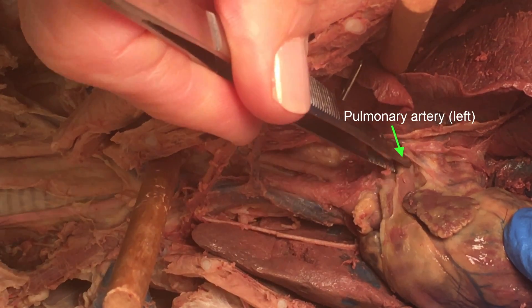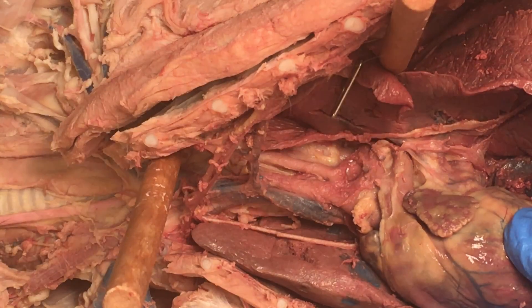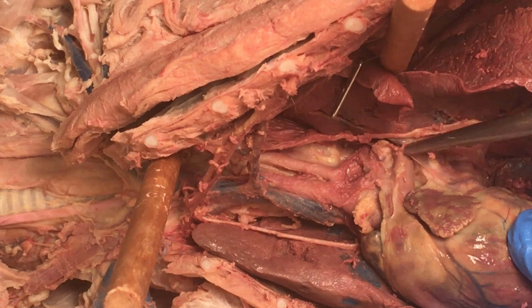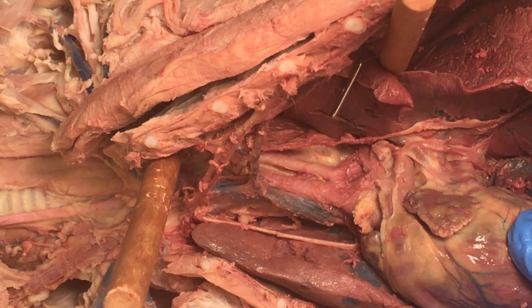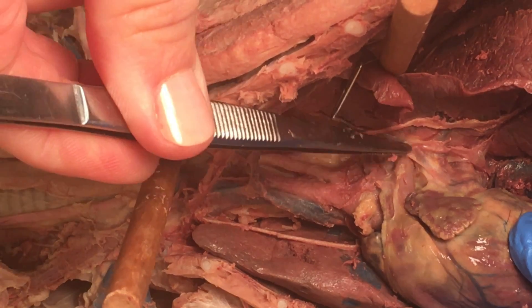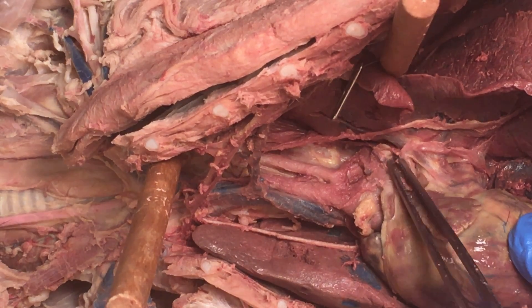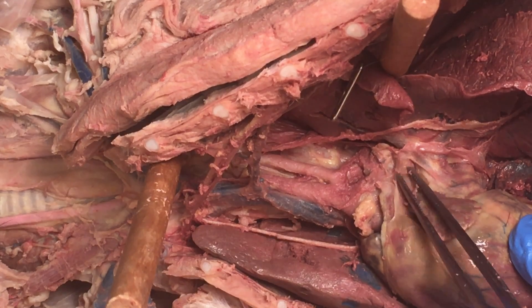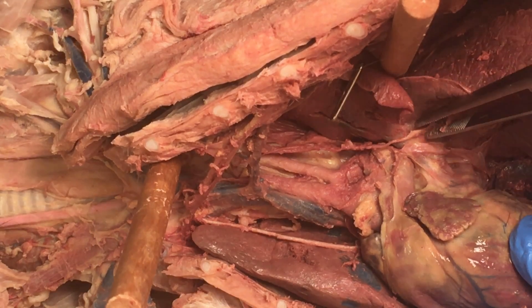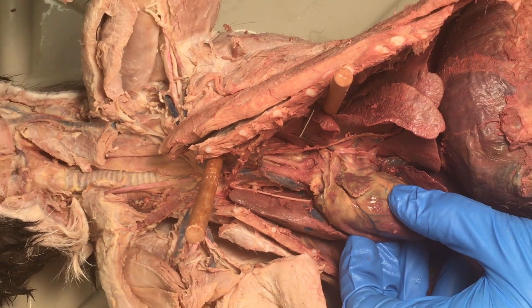The pulmonary trunk narrows into a pulmonary artery. You can't see the split to the pulmonary arteries right and left. One branch is under the heart and the other comes here to the left lung, so you don't see a satisfying Y-shaped split — you just see it kind of narrow and then head into the lung. This is a nerve that's going by.